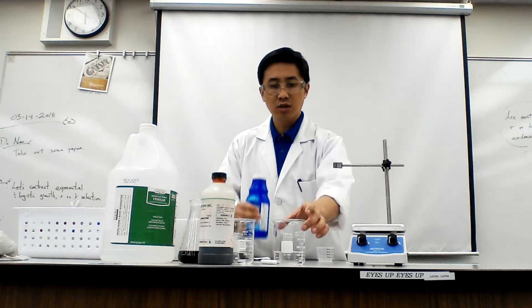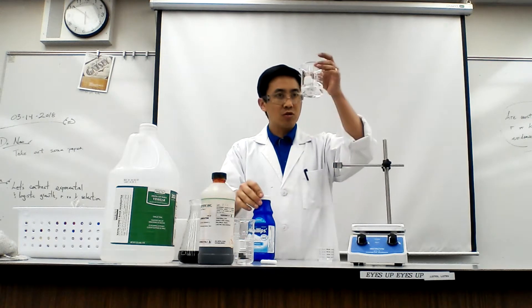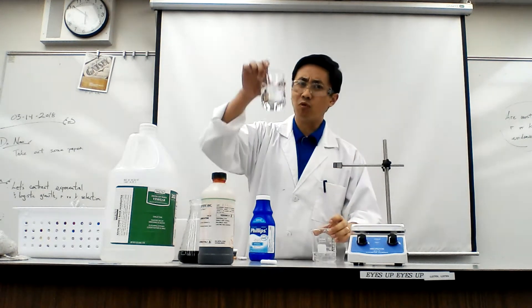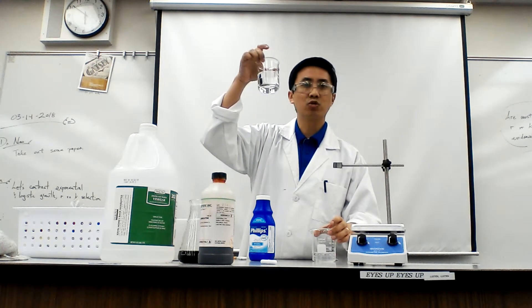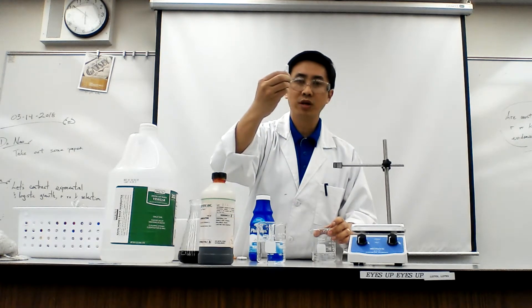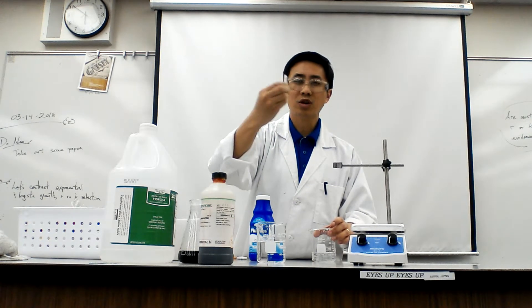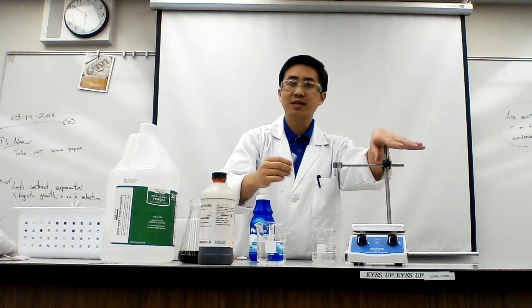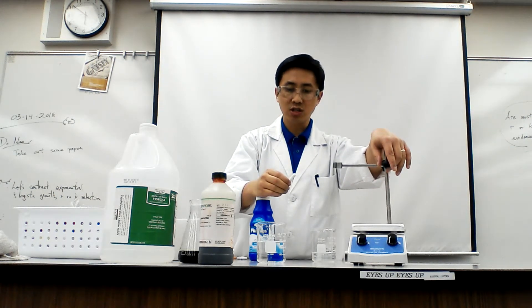Here's what you're going to need. You're going to need a beaker of water — notice that this is actually vinegar — a beaker of water. Notice that I only have around 125 mils. You're going to need a stir rod; these are the little white things. And we're going to use the hot plates again because I want us to start understanding how to use them, since we do have a titration coming up.